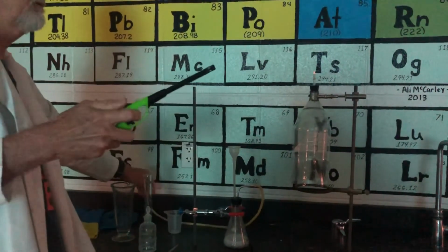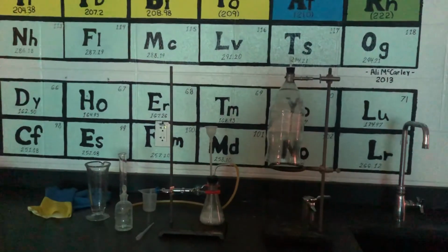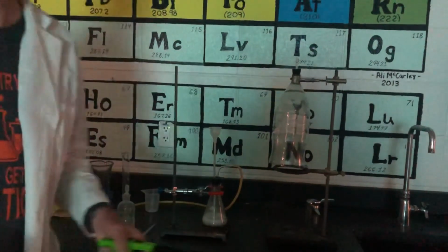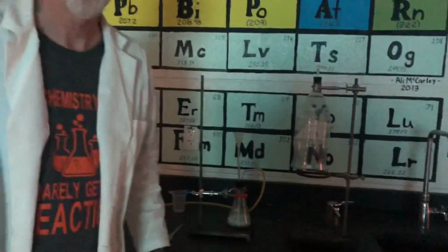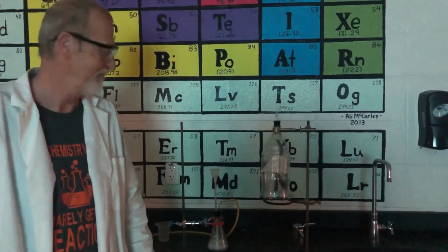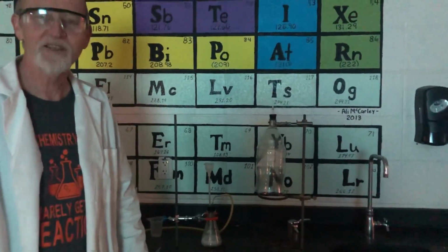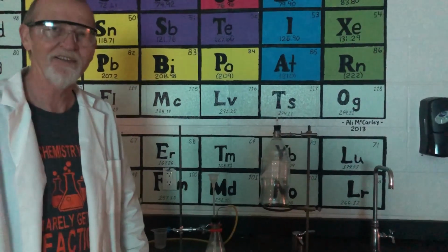Hear the whistle? And there it was. You did hear the whistle, didn't you? And that was pretty dramatic, wasn't it? So I think hydrogen is explosive, so we need to handle it with care.